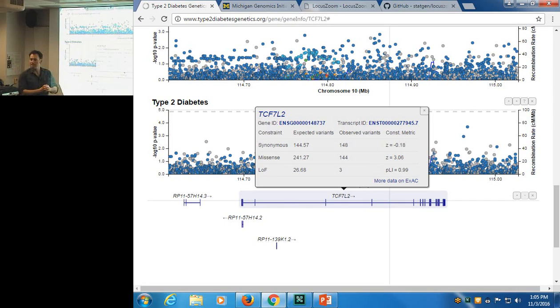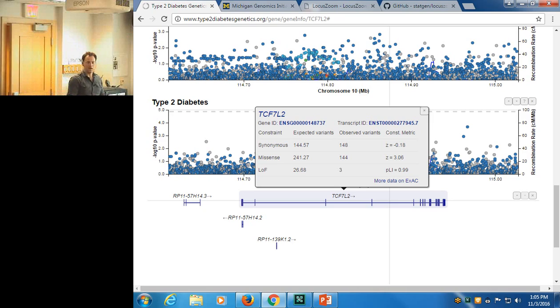Could you add eQTL to this plot? Yes, we could. And actually, there is a gentleman in our group who is really all about eQTLs, and he really wants to see them in here. So that's something that we'll probably be looking at in 2017. That's some nice extra information for the gene layer. Yep, eQTL data, definitely.